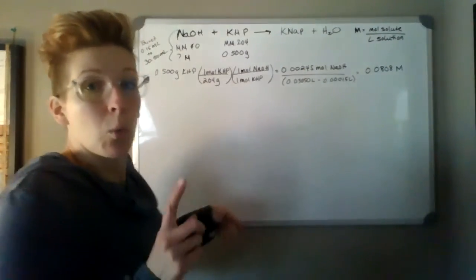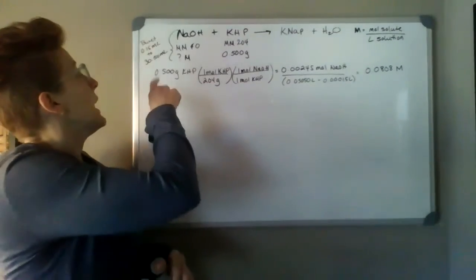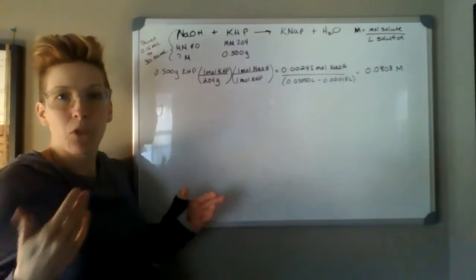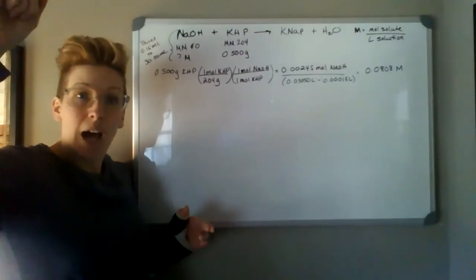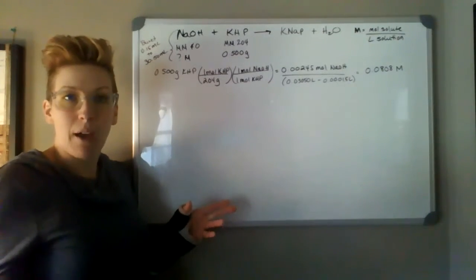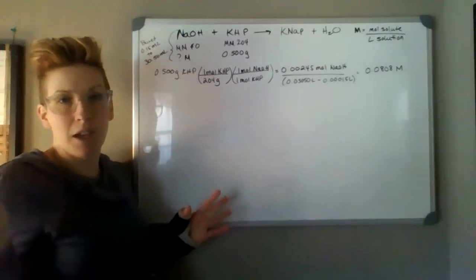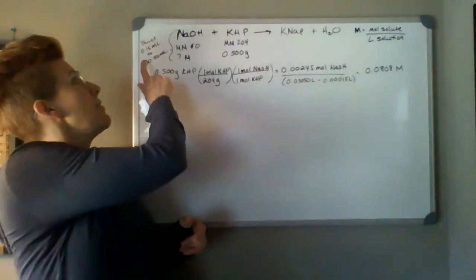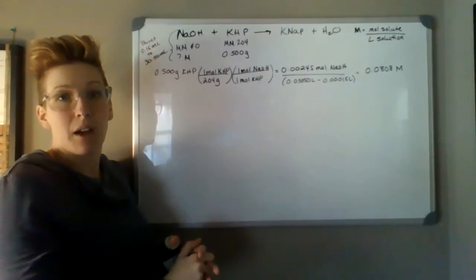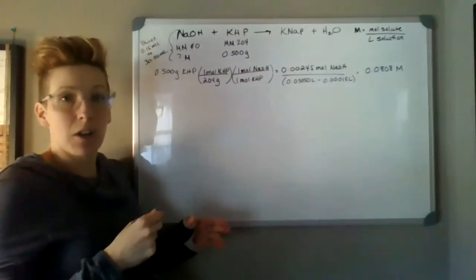But in the problem, we're given that our burette, now again, that's the tube that's graduated, and you'll see that in the simulation, we started with a volume of 0.15 milliliters. Now, in all honesty, you would probably start a titration at 0. So the top, by the way, is 0, and the bottom is, say, 50 or 100 or 25, whatever size burette you have. So what has happened in this is you're actually starting at 0.15 milliliters, not at 0, which is kind of silly. Just go to 0, right? And it tells you in the problem, this is just problem 1 from your lab, that you're ending at 30.50 milliliters. So you haven't used exactly 30, you've used a little less because you started at 0.15.